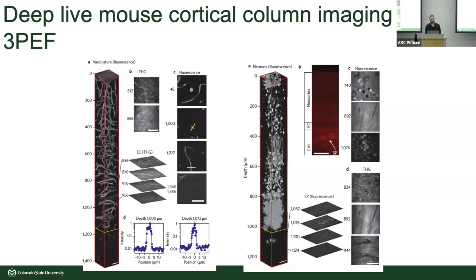For the future of developing this technology, do you see it taking advantage of different wavelengths and photons, using more and more photons, or like the last slide that you showed, where you're changing the scope of the photon? So the question is about the future development of multiphoton. To see if I capture your question correctly, is it more about more photons, so going to higher order photon excitation, or more about something like I showed in the last slide, where we had a different illumination paradigm entirely? The answer is yes, it's both.